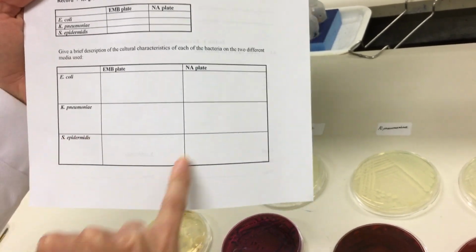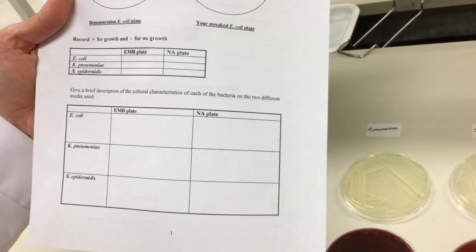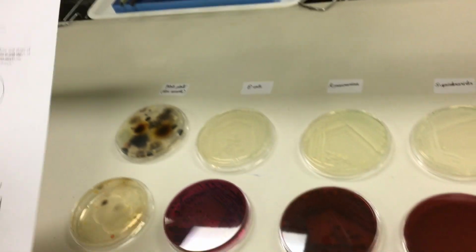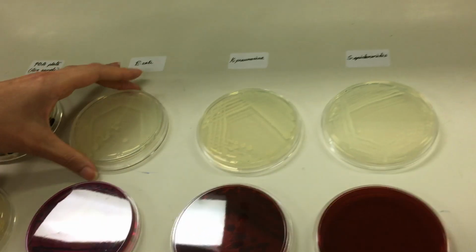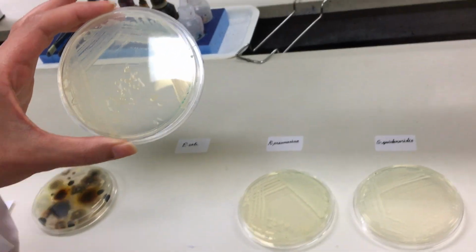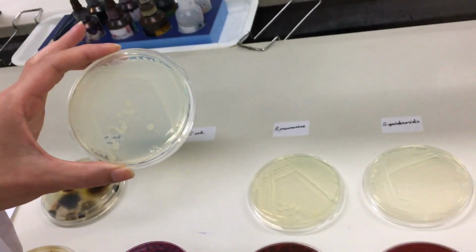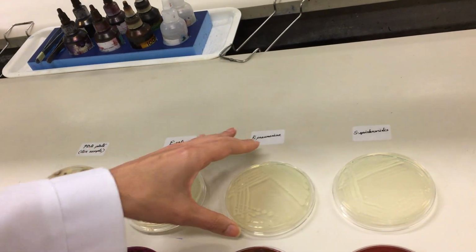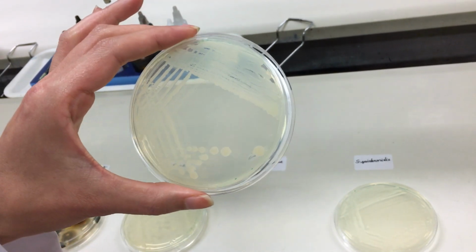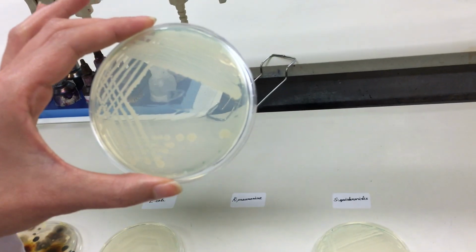In the next part, you are going to give a brief description of the cultural characteristics. So you need to see what is the color, what is the size, and what is the shape of the colony. We might have some additional pictures, but you are recommended to search online and find this selected bacteria on the selected media that we suggest.